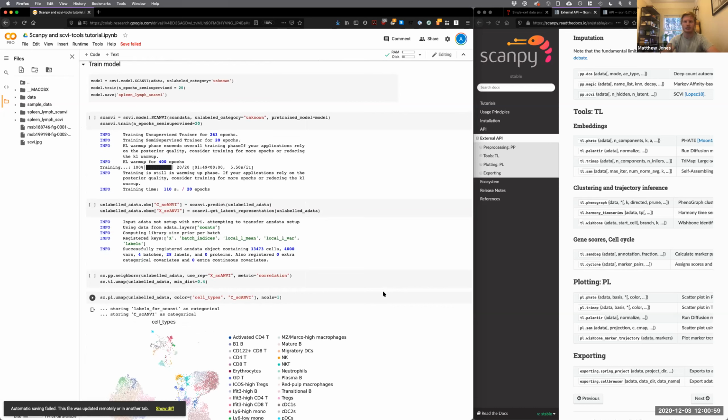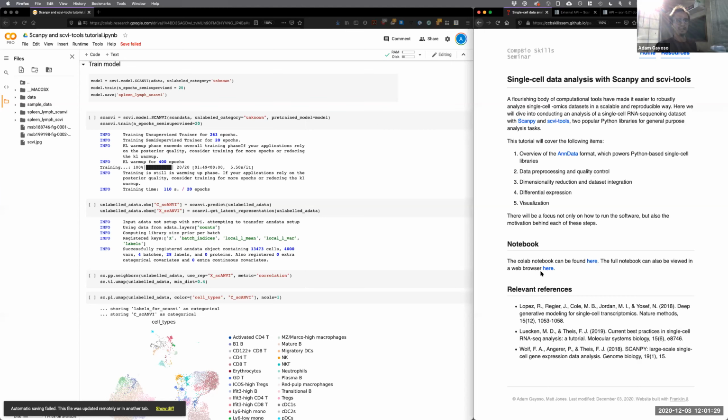Yeah, that's a helpful answer. We have some other questions in the chat as well. Someone's asking if you could send them separately the imputation choice paper. I think you referenced a couple of papers that talk about whether or not to use imputed counts. I think people might be interested in those papers. Yeah, I can. I'll add those references to this website, more references related to the imputation.